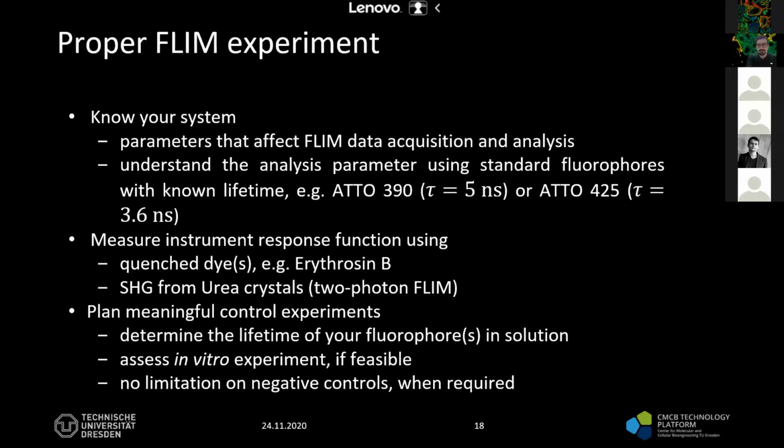Yes. It seems that we have something in the chat: is that any different from measuring intensities? That's for sure. Yes, but you've described the problems associated with the measurement of fluorescence lifetimes, and I think there are similar problems in comparing results when you quantify or measure intensities.